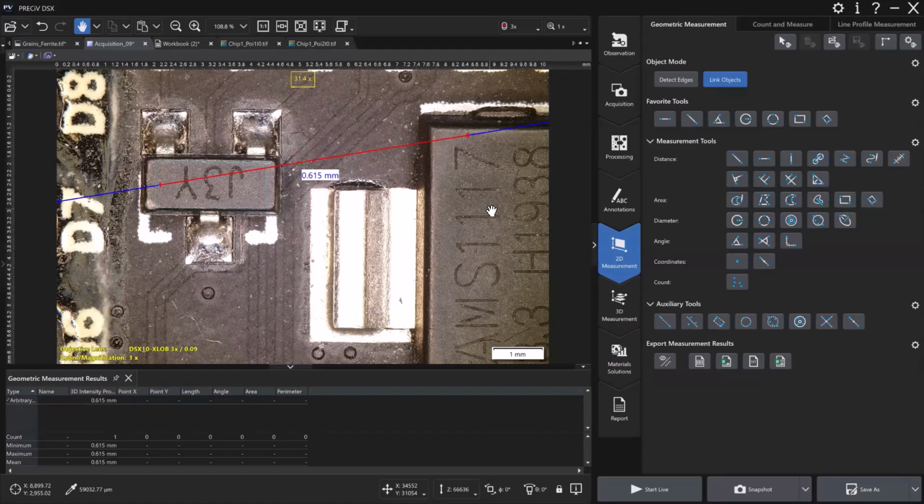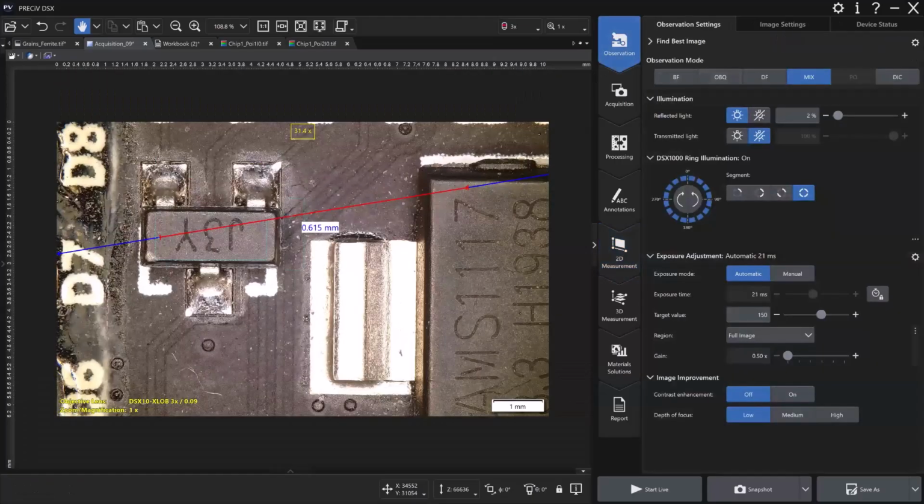You had mentioned earlier that PRECiV is universal. The software is intended to be used across all sorts of Olympus models. Can it be used with third-party instruments as well? Not Olympus, not Evident? Yeah, another great question. If you were to connect to even a legacy Olympus product that might be old enough that it doesn't have connection capability to a PC, like our new ones have simple USB connections in most cases, even then it can connect to either third party or older legacy systems. You just won't have some of the controls. They'll be more manual in the software.